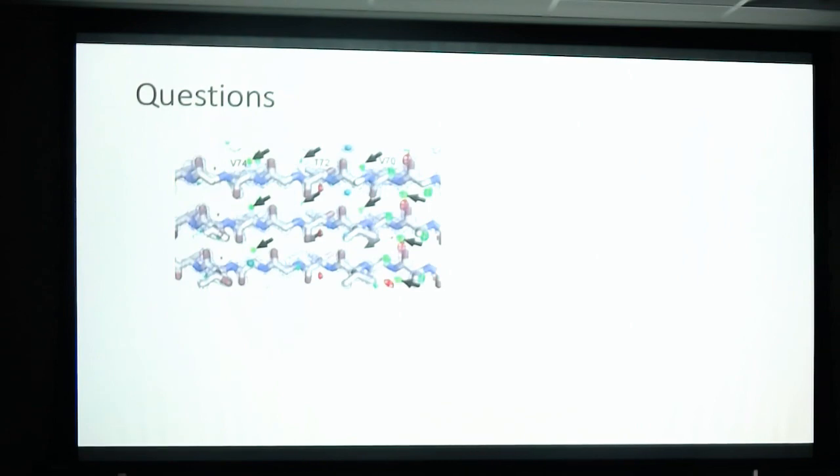You could have crystals that are not good by X-ray, but if you looked at an edge of them or broke them up by microED, they might be good enough. I think in one of the papers where they were breaking up the crystals, that was the case for some of them. The whole crystal itself didn't diffract very well, but a little piece of it was good. So it had mosaicity or something to it. It wasn't very well ordered overall, but the little pieces were.